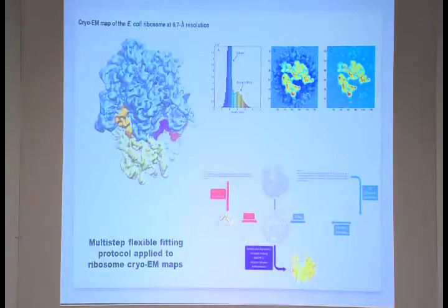You first do all the fitting of the RNA, the core RNA structure, and the tRNAs you can do afterwards, because the occupancy of the tRNAs is actually less most of the time. So the tRNA may not have the same density values, voxel values, as the RNA. So first you do all the RNA, then fix the RNA structure, and then the rest of the structure you fit step by step with proteins.